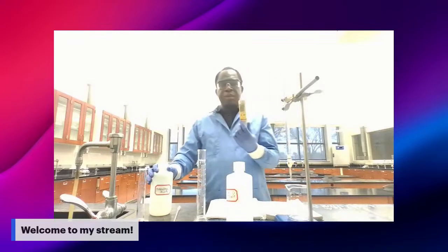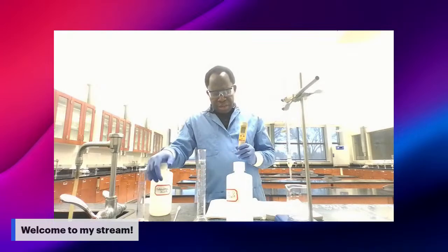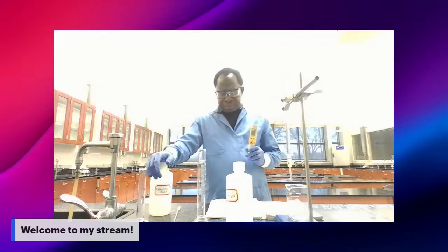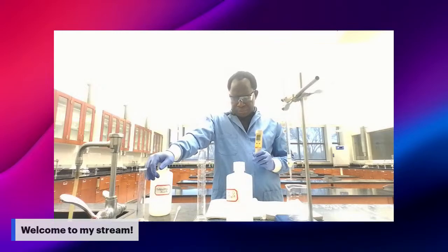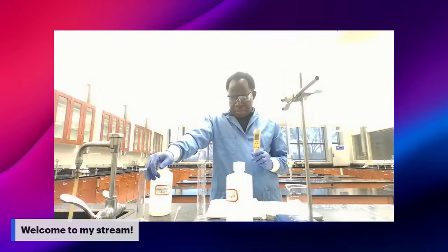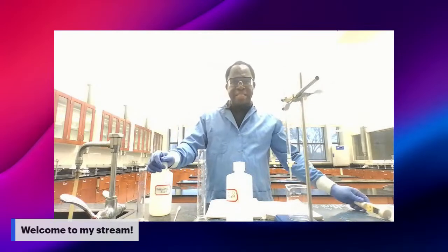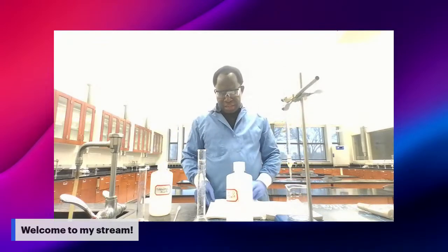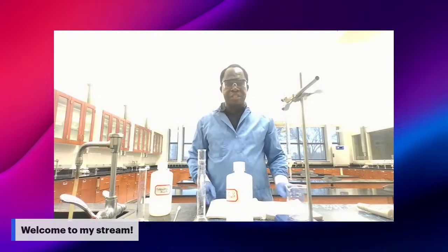This is the pH meter we are using in the lab. You should have one also to use during the lab. And part 3 is the titration, where you are going to perform what we call a titration.